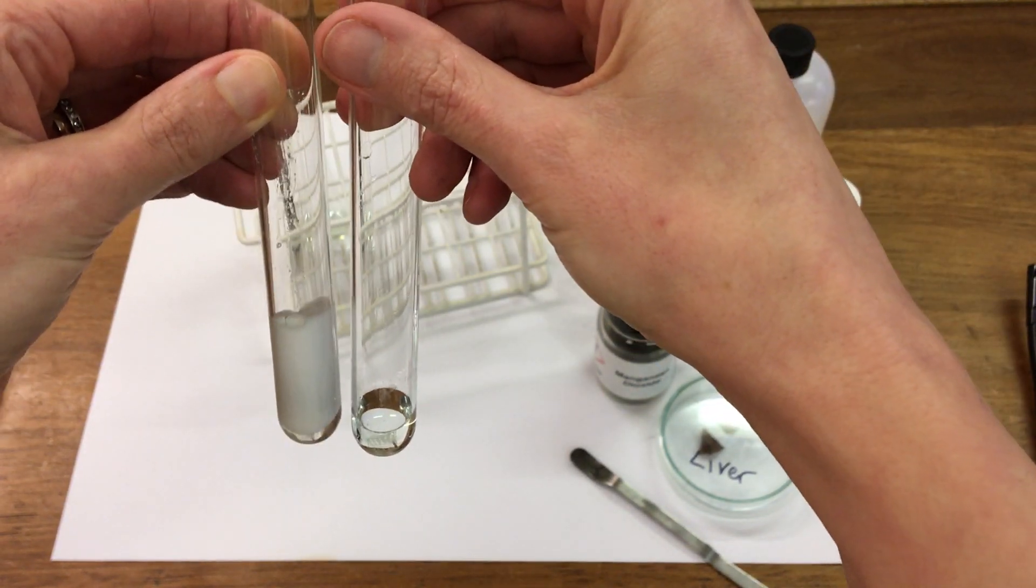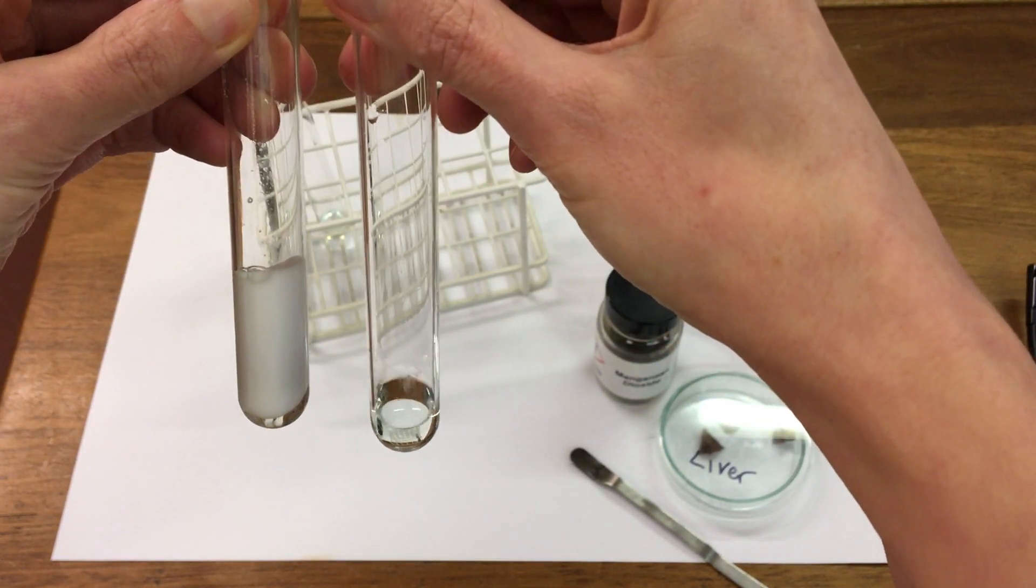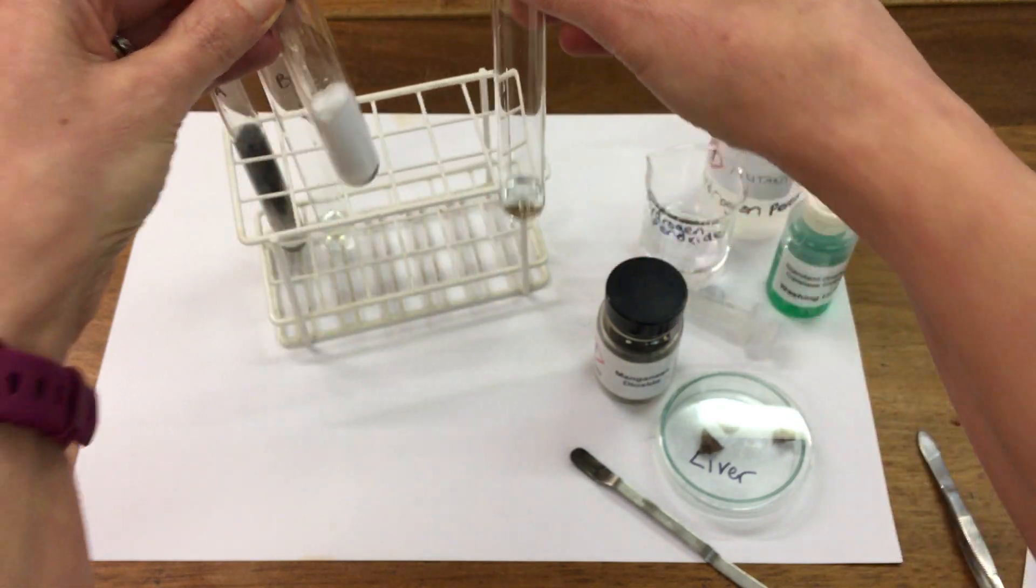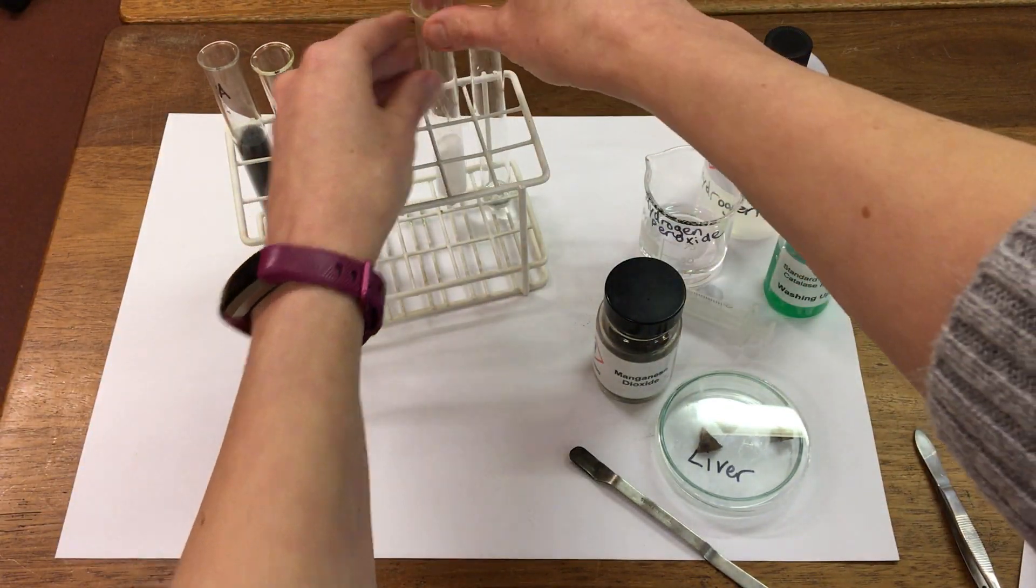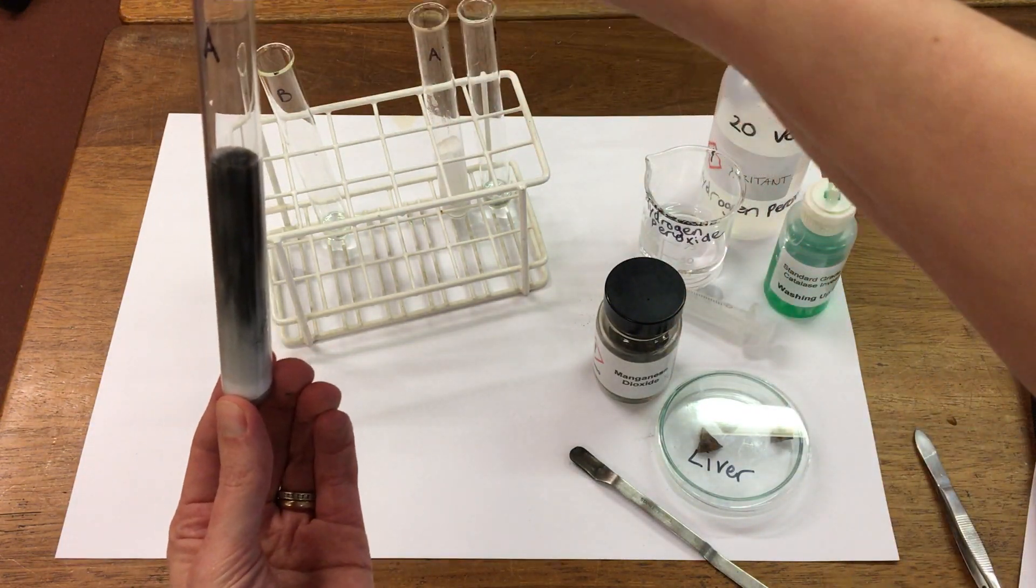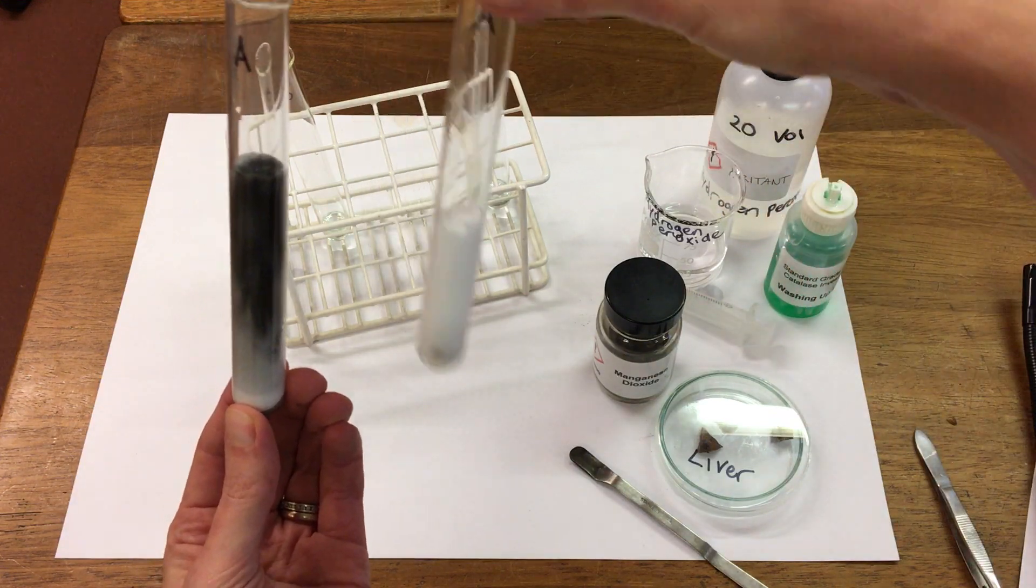So by using detergent we can measure the amount of gas being produced because it's trapped in the foam. So again this is the manganese dioxide and this one is liver.